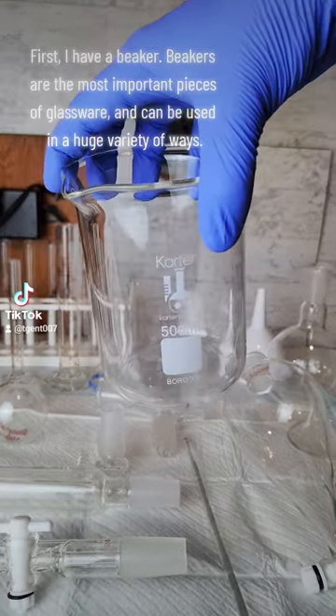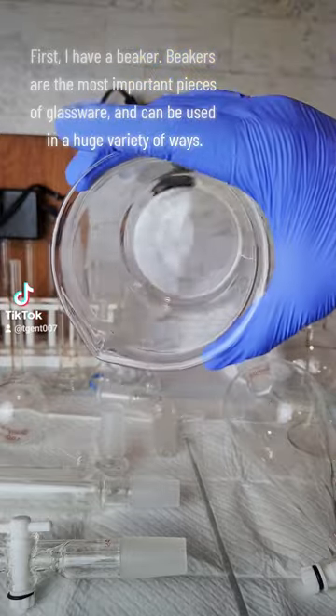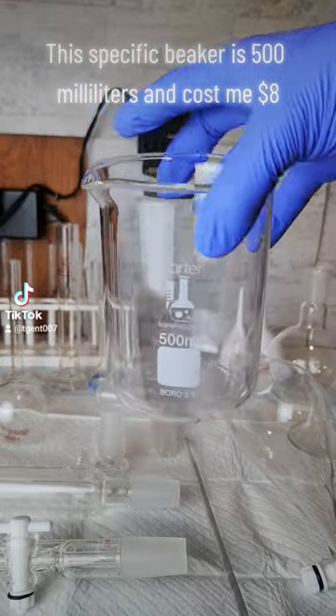First, I have a beaker. Beakers are the most important pieces of glassware and can be used in a huge variety of ways. This specific beaker is 500 milliliters and cost me $8.